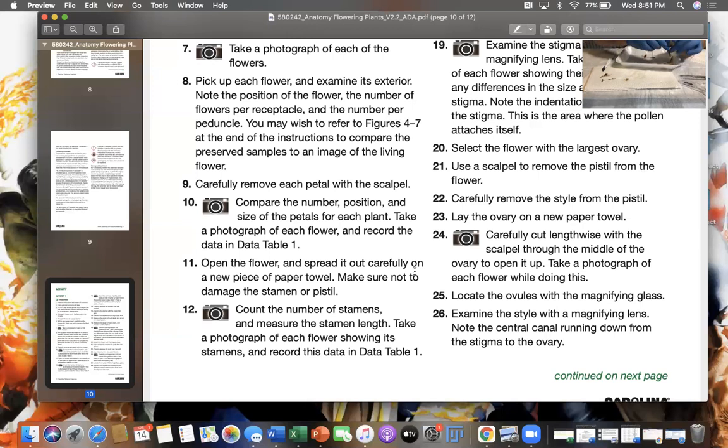This one out of the way. Taking care of the petals on that is a lot less surgical than the lily, but effective either way.